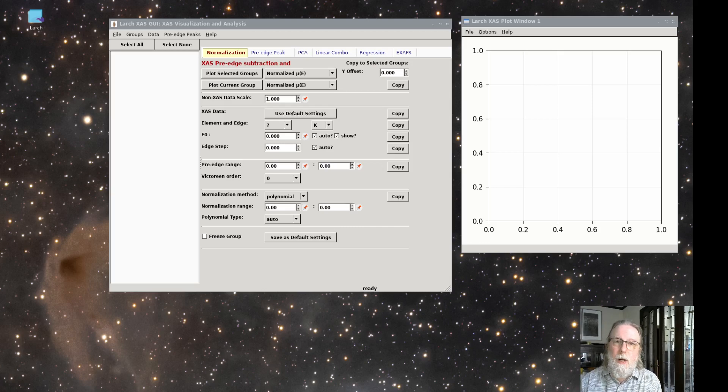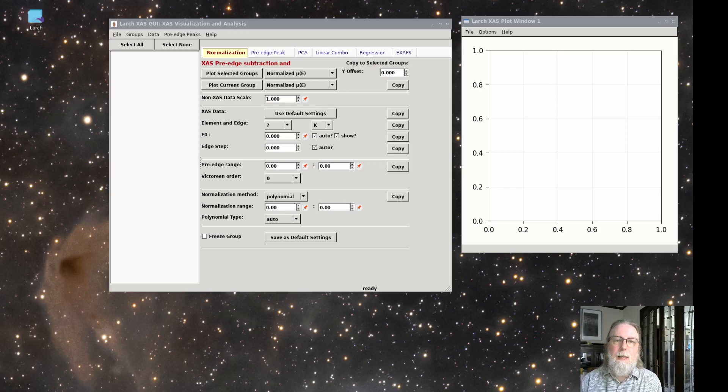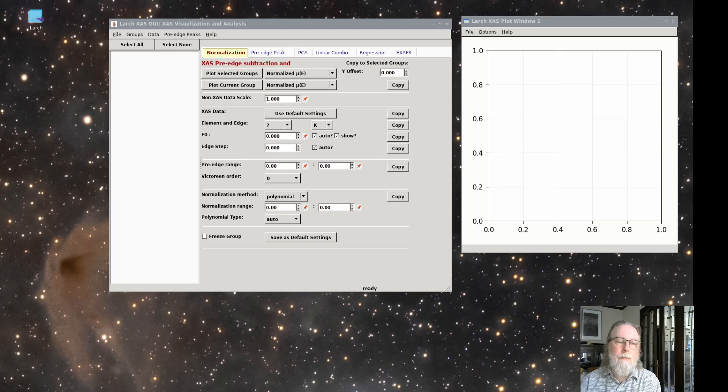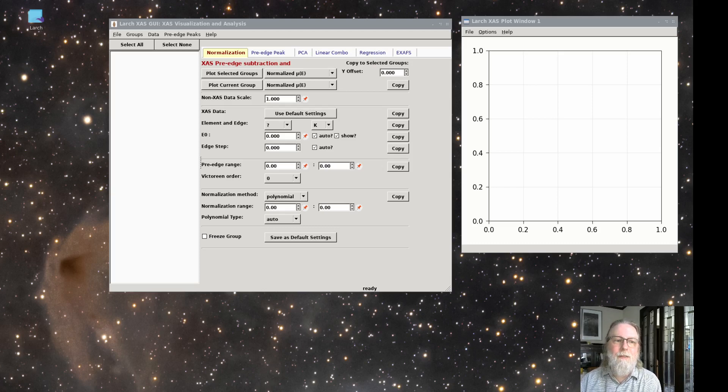And then can directly compare these normalized data for the same element and edge, no matter how it was collected. And this is important for all Zanes and XFS analysis methods.